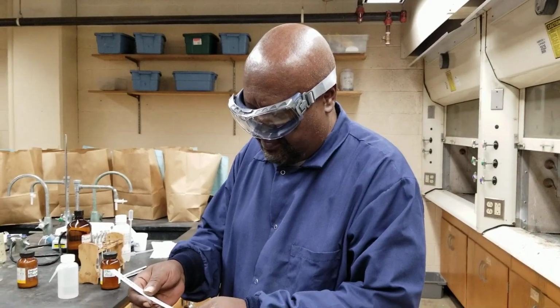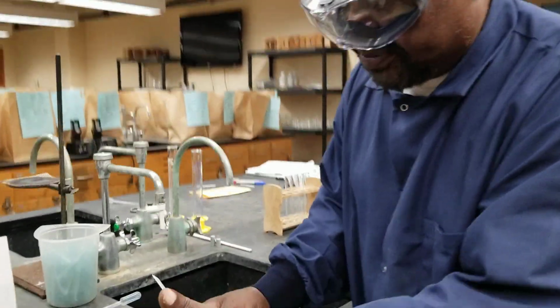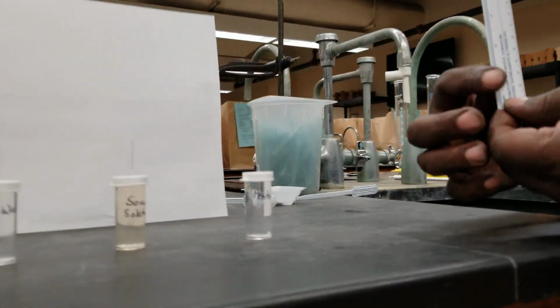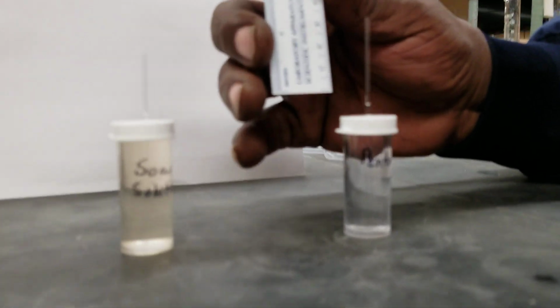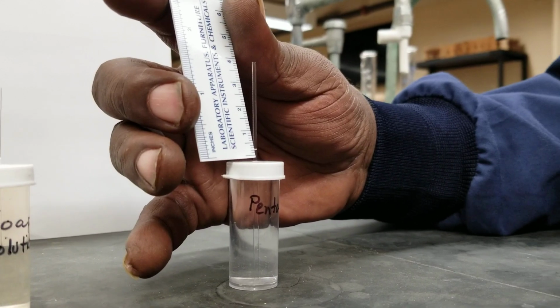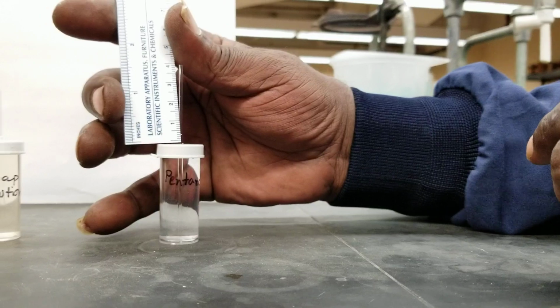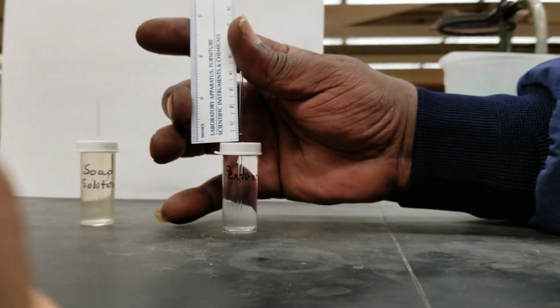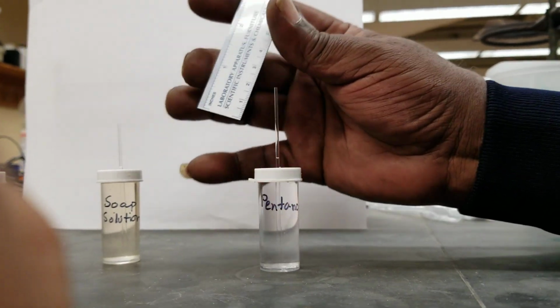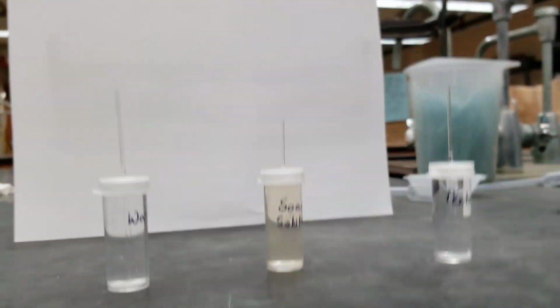Now we're going to measure the heights, capillary tubes. These are full of water, soap solution, and the pentanol. I'll start with the pentanol. Kind of tricky here. I don't want to press on top here because that'll push up. I'm going to read that as 4 millimeters. If you can't see, I apologize for that. It's a little tube, capillary tube, and so maybe hard to see. How about we call that 4 millimeters? That's the capillary rise in the pentanol.